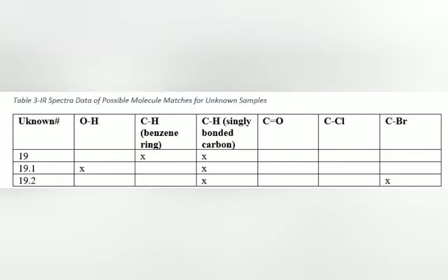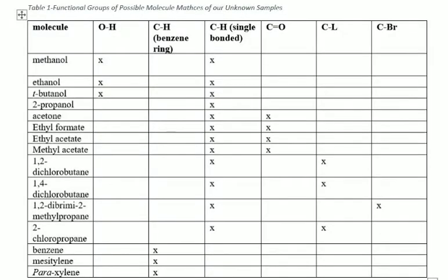To quickly summarize, IR spectrometers work by finding the absorption of a photon through infrared waves. This is used to determine the kinds of hydrogen bonds of the substance in question. This helps us to find what functional groups are in our molecules. By understanding the different ranges of absorption and how they correspond with different functional groups, one can accurately put the puzzle pieces together.